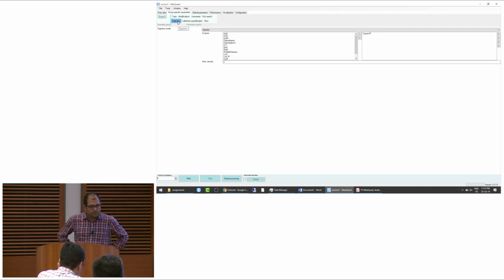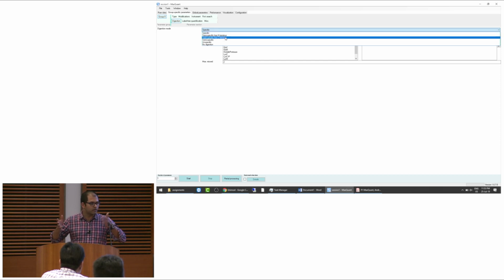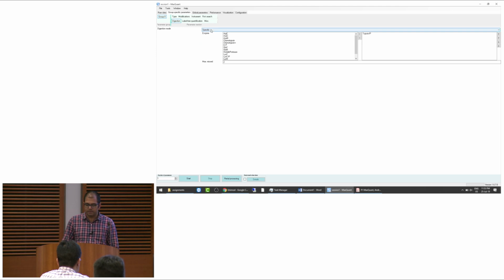digestion, in this case it's trypsin, and the maximum missed cleavage is set to 2. That's the default value, and we can just leave it at that value. And here in the digestion mode, you have specific, it could be semi-specific with free N-terminus, meaning the N-terminus is kind of degraded peptides. It could be semi-specific C-terminus, or it could be both, semi-specific, or unspecific and no digestion. But in this case, we use specific. Right? Can you see that? Yeah.